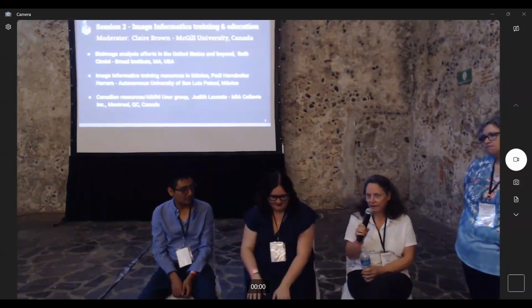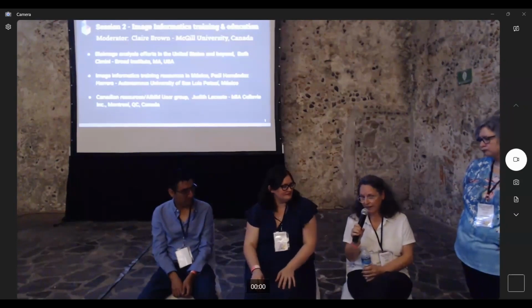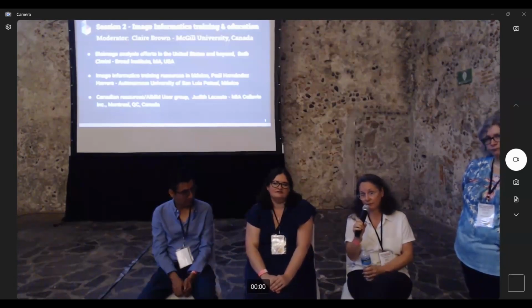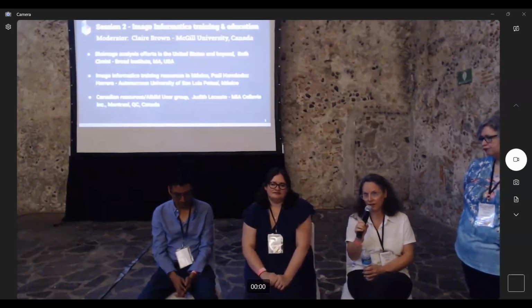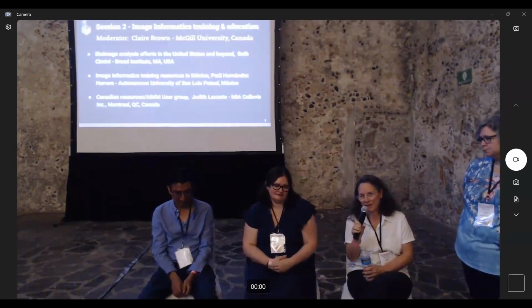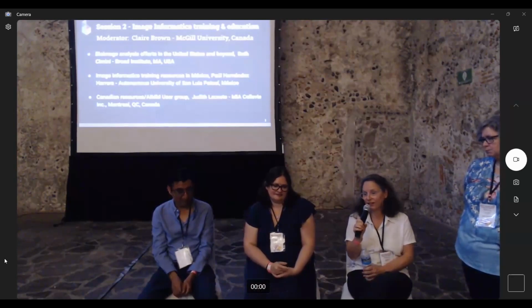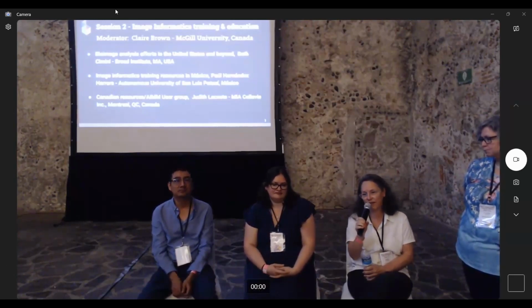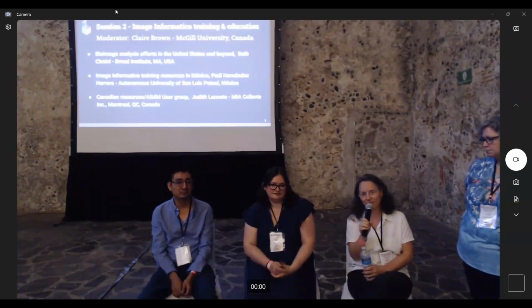But yeah, I really strongly believe that as a core facility manager, if you can sensitize your user about the importance of the image life cycle, that's already a huge step. And you can get started at different levels, and you can go really, really deep, but you can make it simple to start with, and that's already a big improvement.